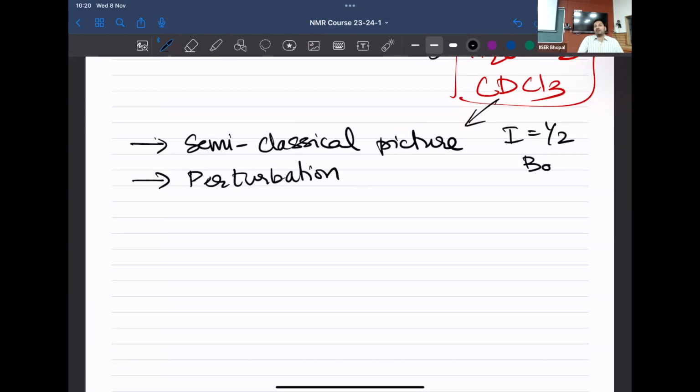And how does this RF pulse end up affecting the bulk magnetization? And therefore, how are we able to collect a signal called the free induction decay? And why did we bother about it? All important information of chemical shifts, scalar coupling, etc., are hidden within the FID, which, if you're able to extract, you would be able to characterize the system.